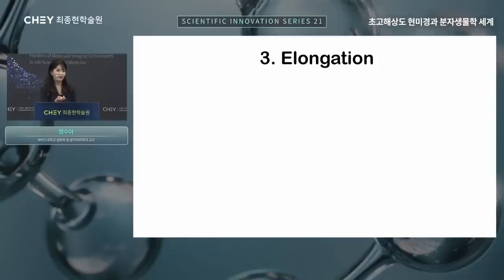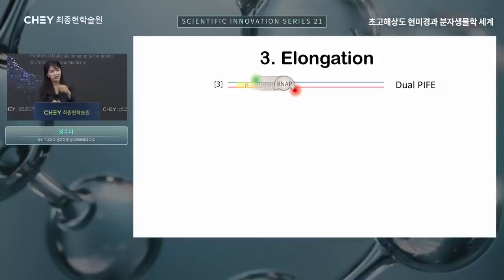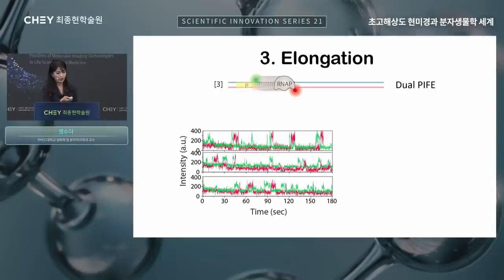So now let's look at the elongation, which is really the race from green dye to the red dye. So this is not FRET, although there are two dyes. It's located outside of the FRET sensitive region. So we actually look at the green signal lighting up when the RNA-P binds, and then when it gets to the red signal, then we see the red signal increase. So what it looks like is shown in these single molecules. Sometimes it fails, so the protein binds to the green signal. It doesn't make it all the way to the red signal. But all the successful events will have tandem green-red signals, as you can see.